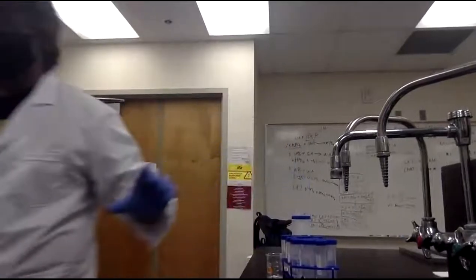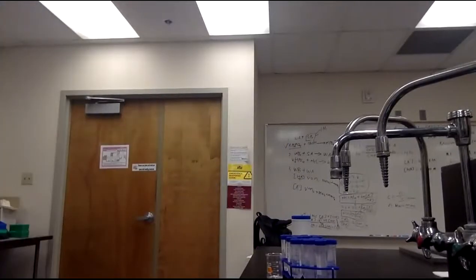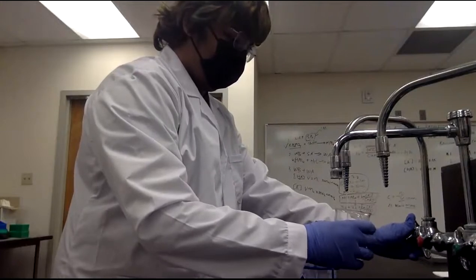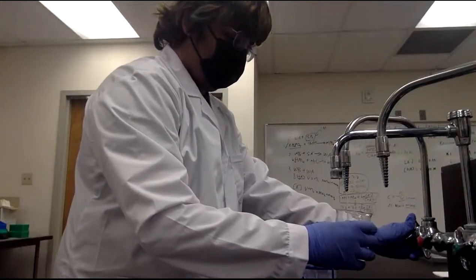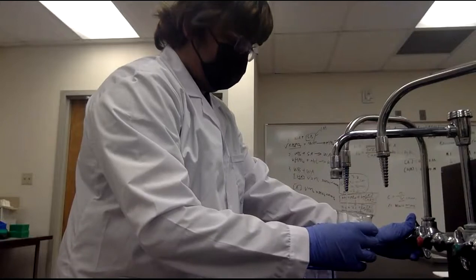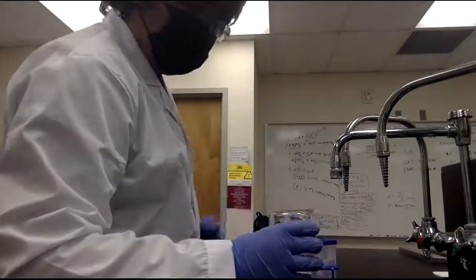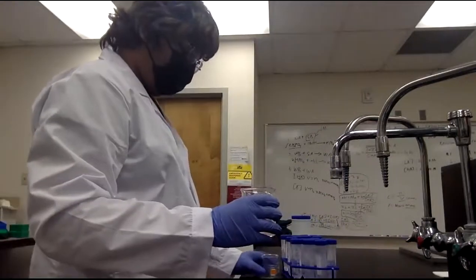I'm gonna do it a bit differently this time, just to make sure. This time I can get a bigger beaker because you need to use enough water to dissolve that buffer. I'm just gonna do this to make sure there's no high pressure spillage again. Let's go. Okay. So you pour it to about 40.